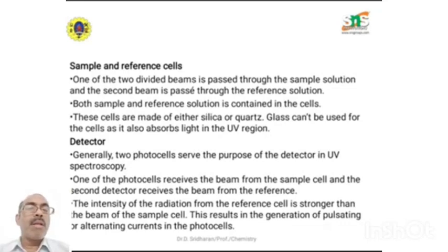Both the sample and reference solutions are contained in the cells. These cells are made up of either silica or quartz. That is, transparent glass vials. Glass cannot be used for the cells as it also absorbs the light in the UV radiations. We use a special glass, that means it will not absorb the light.